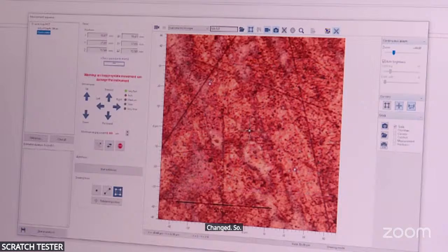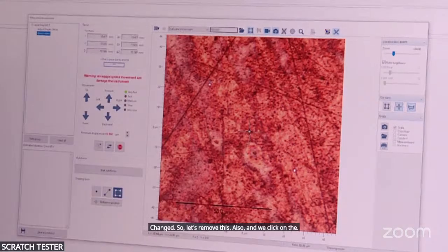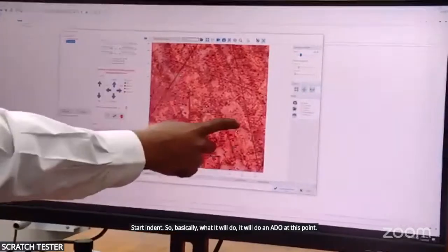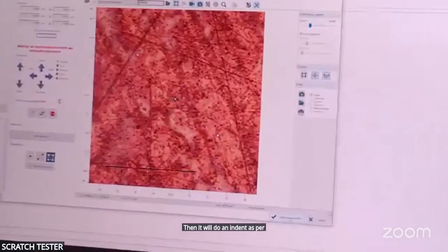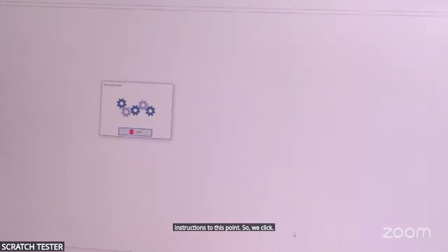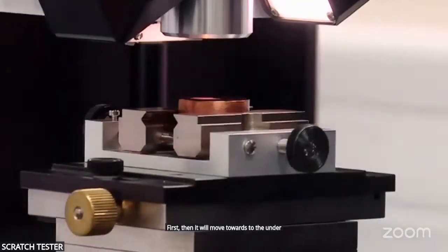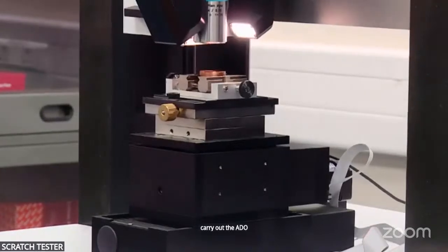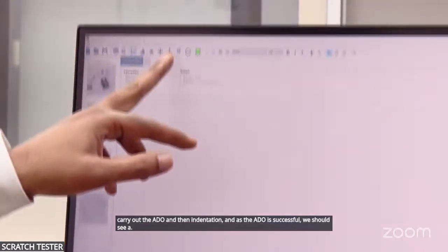So let's remove this also, and we click on the start indent. Basically what it will do is an ADO at this point, then it will do an indent as per our set instructions to this point. So we click start. You can see now, the stage will go down first, then it will move under the indenter as per our reference and carry out the ADO and then the indentation. And as the ADO is successful, we should see a green sign here also.